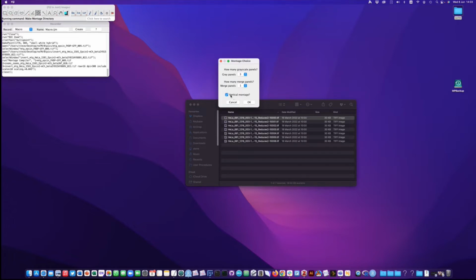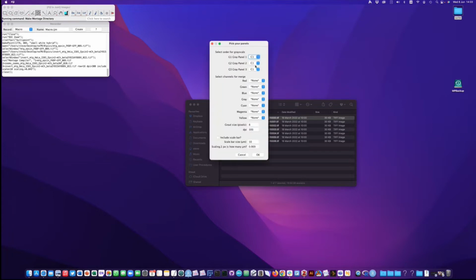If you don't check that, it doesn't know, and it will do it the way that the previous example was done. So again, we need to know what's what. I'm just going to put anything in here, just to say that you can do whatever merges you like here. It's just our lab preferences for RGB and a maximum of 3 channels shown, unless we really can't help it. Grout size is 8, but these are very small actually, so I'm going to change this to 4.